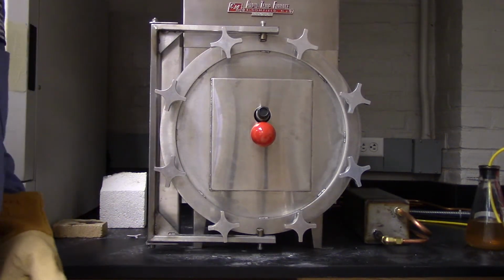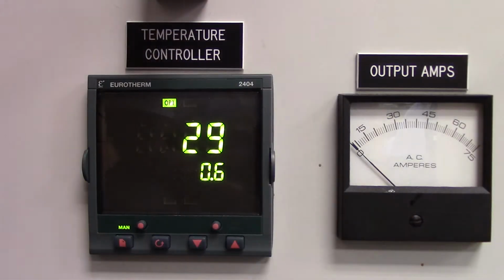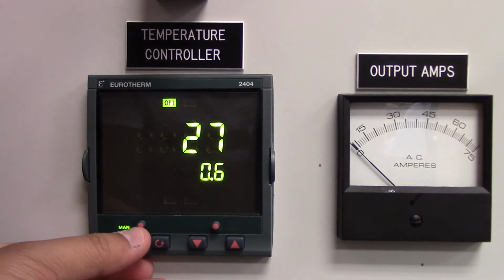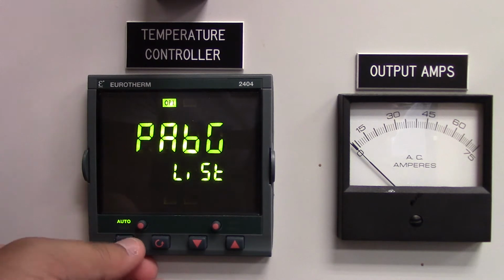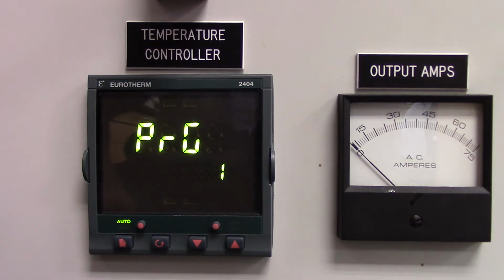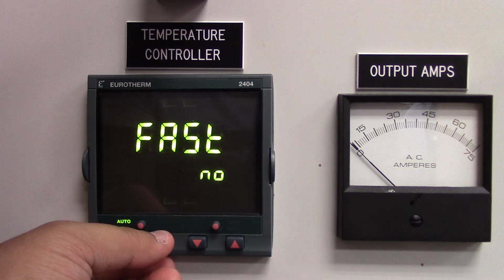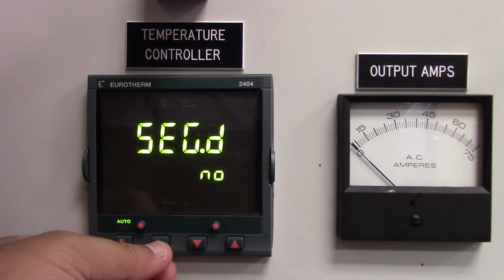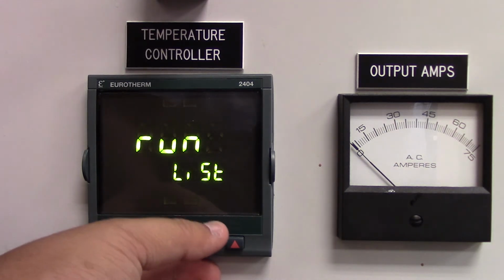Okay, so let's switch back over to the controller. Now that we finished creating our program and we put our sample in the furnace, we now want to set the furnace to run. So to get it to the run operation, first, let's make sure that we take this off of there and we set it to auto. And then let's put it on to the run. I'm sorry, I missed it the first time. There we go. We want it to run program 1 because that's the one that we made. All of this stuff, stat you keep at no, fast you keep at no, segment duration, no. There you go. And now we press this to run.